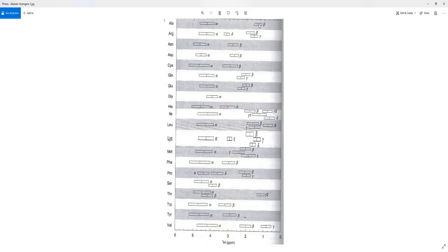So alanine betas are a little bit on the lower end here, along with, say, leucines. In this case, histidines and phenylalanines, tryptophans, and tyrosines, along with cysteine, asparagine, and aspartic acid are really unique because their C betas are in the 3 range.